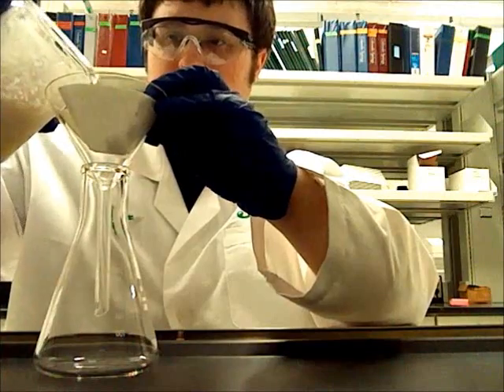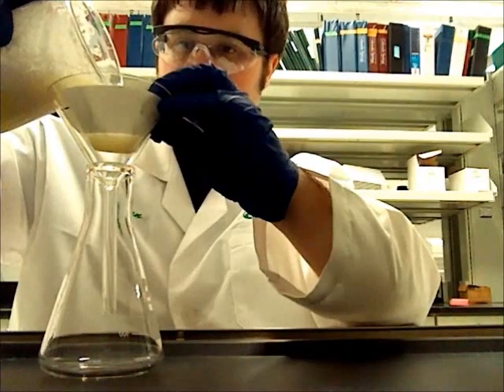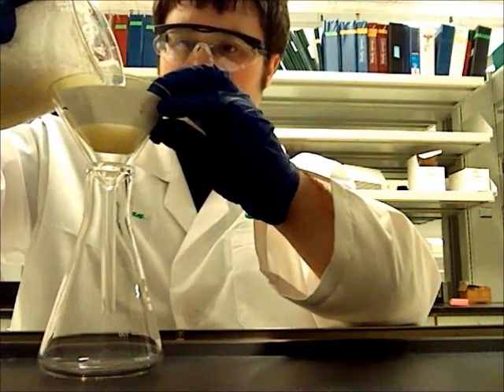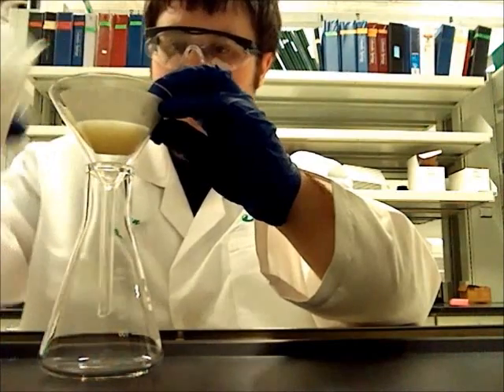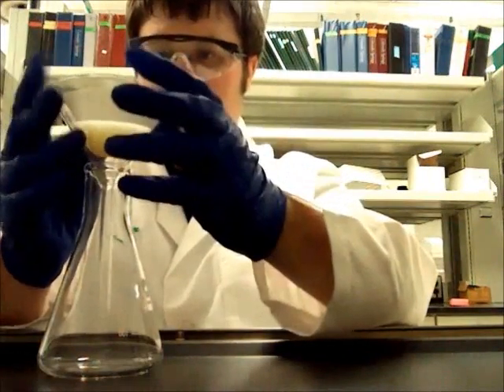After that, I filtered the mixture to remove any residue. Left in the filtrate was aqueous bismuth chloride. I would like to note that the filtrate is usually pink. In this case, it was yellow, though I was still able to extract the bismuth.